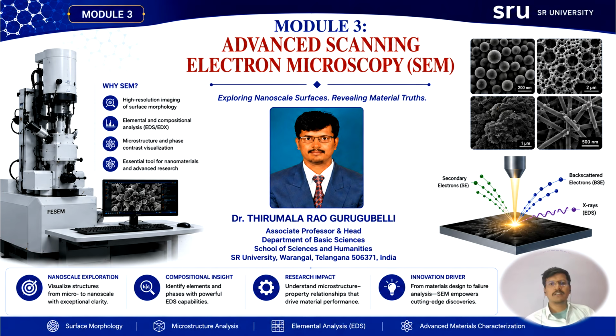As shown in this slide, SEM offers several advantages. The first one is that it provides high resolution images of surface morphology. This means we can visualize the surface structure of materials, including roughness, pores, cracks, particles, and nanostructures.